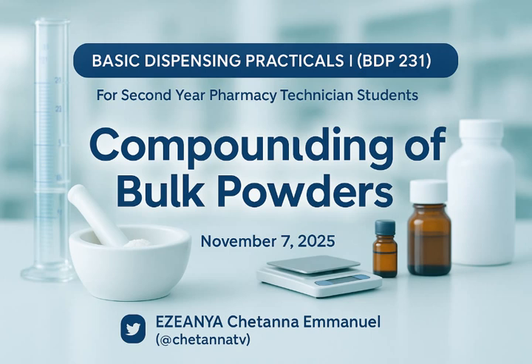Is that clear? Good. Now, of course, powder should be protected from what? Sunlight, right? It should be protected from sunlight. Now, another thing I want you to note here is that the manufacture date, the date you manufactured it, is today, right? You write today's date.